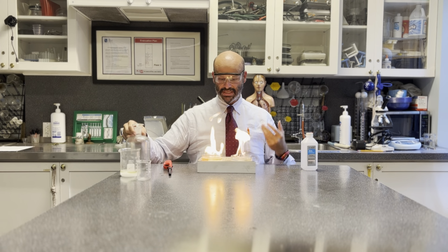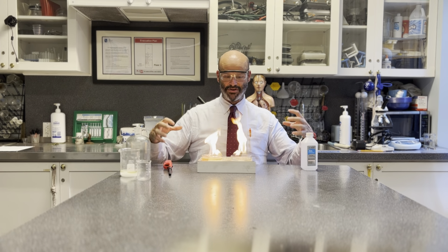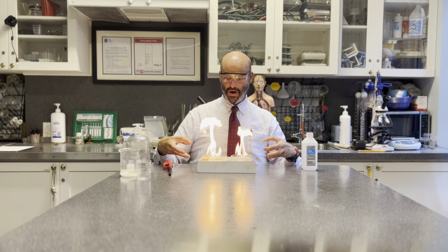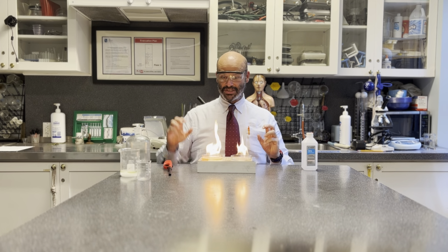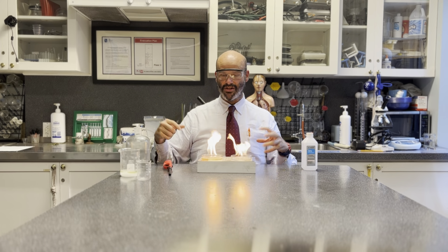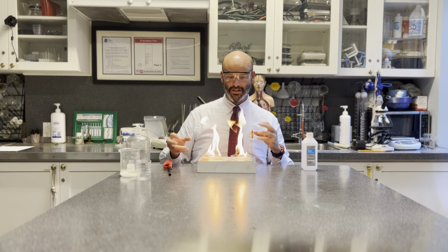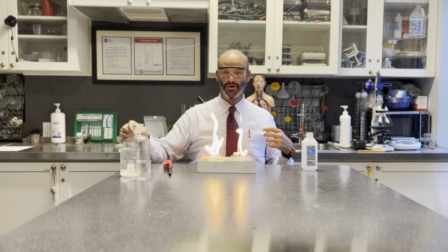All right, so we're seeing the flame is different. It's dancing around differently because there's differences in how the oxygen is interacting at these particular spots. We're seeing a difference in height. We're seeing a difference in color. All of that is a result of the amount of water and alcohol in each of these samples. All right, it's getting a little warm in here, so we're going to put this out.